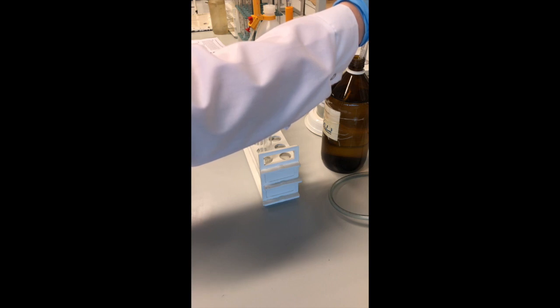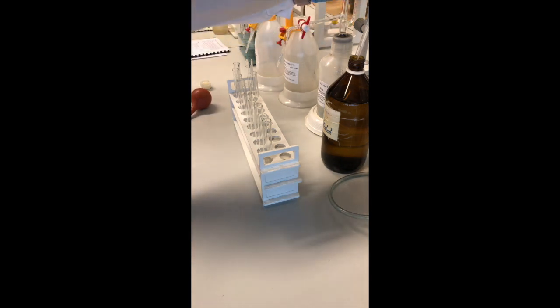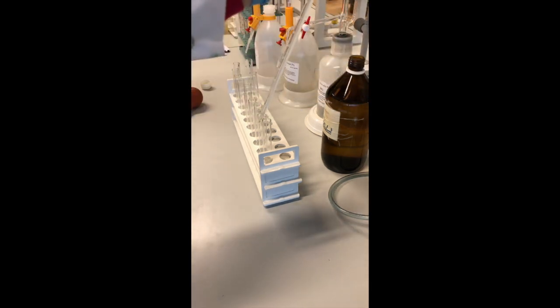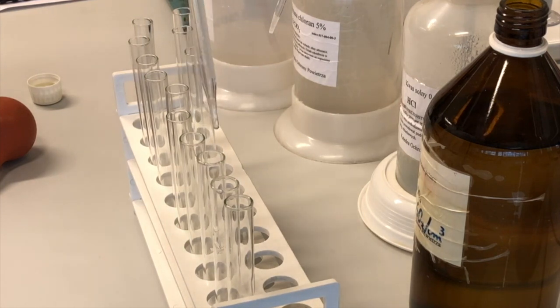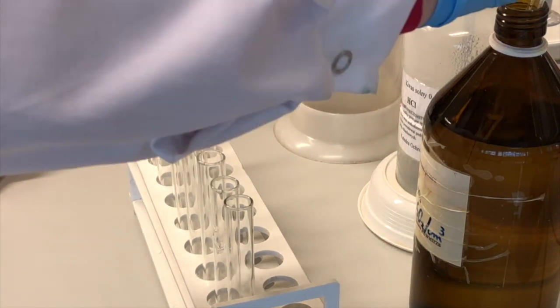So we will start with the first. The important thing, remember not to blow out the solution from the pipette. It should be left like this. And the rest.